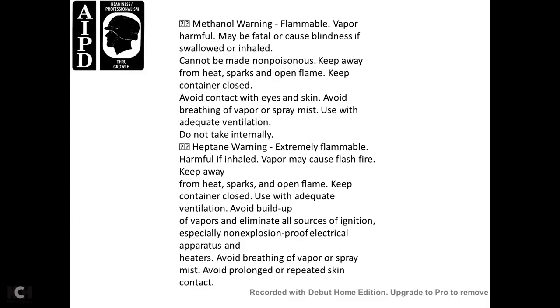Methanol warning: flammable vapor, harmful, may be fatal or cause blindness if swallowed or inhaled. Cannot be made non-poisonous. Keep away from heat, sparks, and open flame. Keep the container closed. Avoid contact with eyes and skin. Avoid breathing the vapor and spray mist.